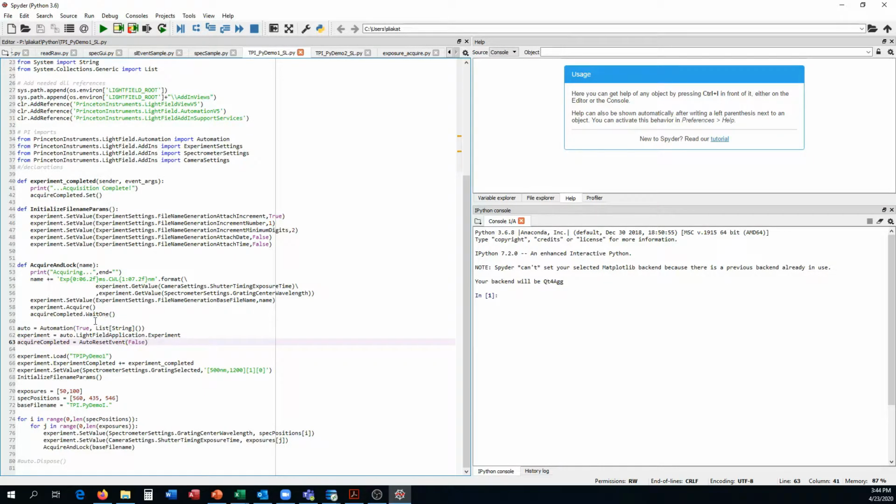So when you put this wait one there, that was like setting it to true. When this event is true, it means that you're going to lock the thread. You're not going to let anything else run on this thread. And now I set this, and now I'm back to the false state where the thread can continue. So we're going to wait one. We're going to acquire, then we're going to lock. That's what this wait one does.